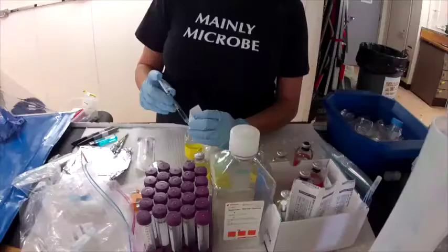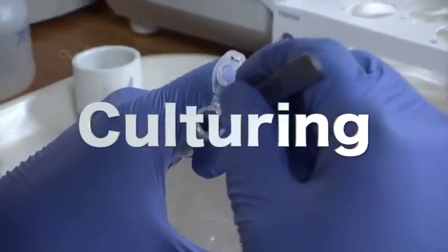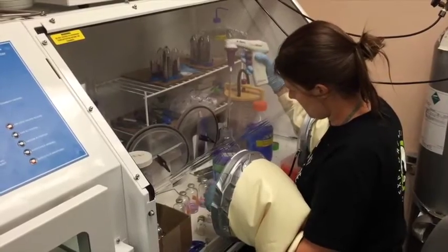Another way to see what microbes are in a sample is called culturing. The scientists try to grow new microbes from the ones that are living in the sample. The more microbes there are, the easier it is to learn about them.